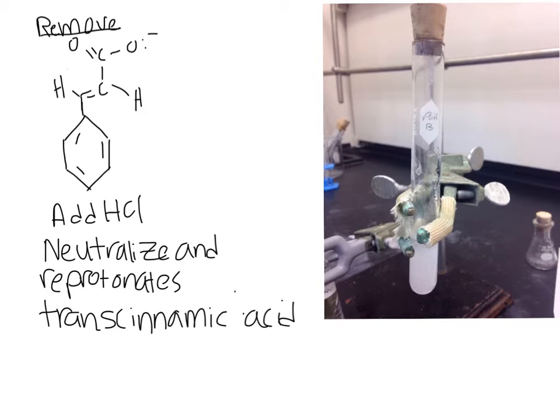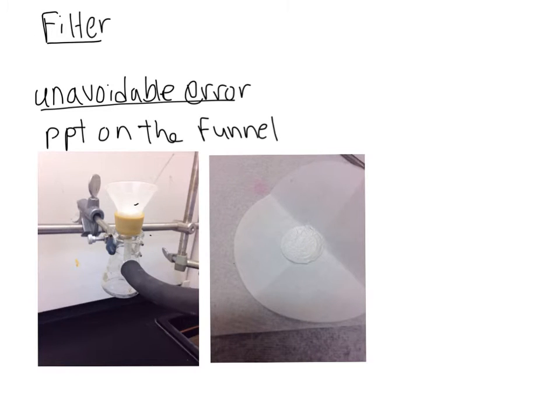And here I removed my acid, and then I added HCl. And then once I added HCl, it neutralized the acid, so it precipitated out. And here I collected my precipitate.